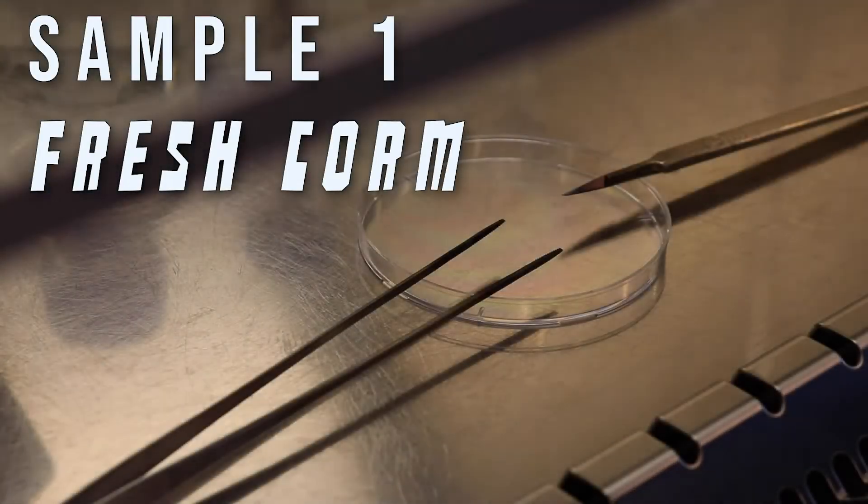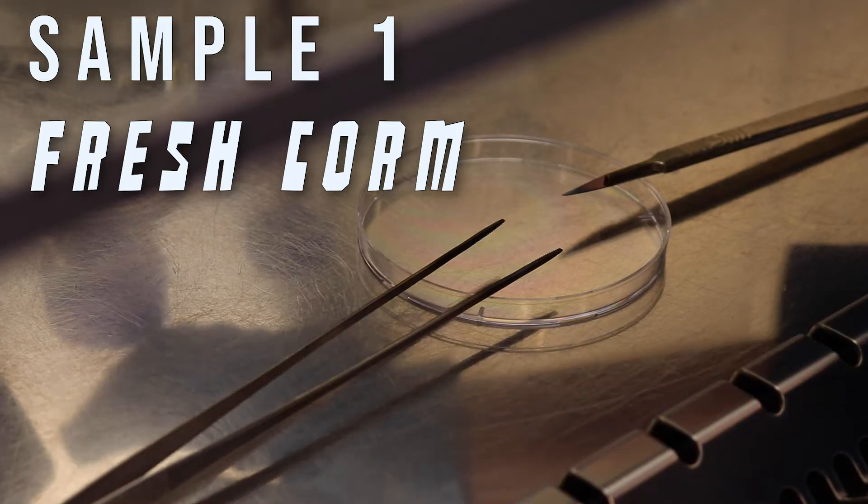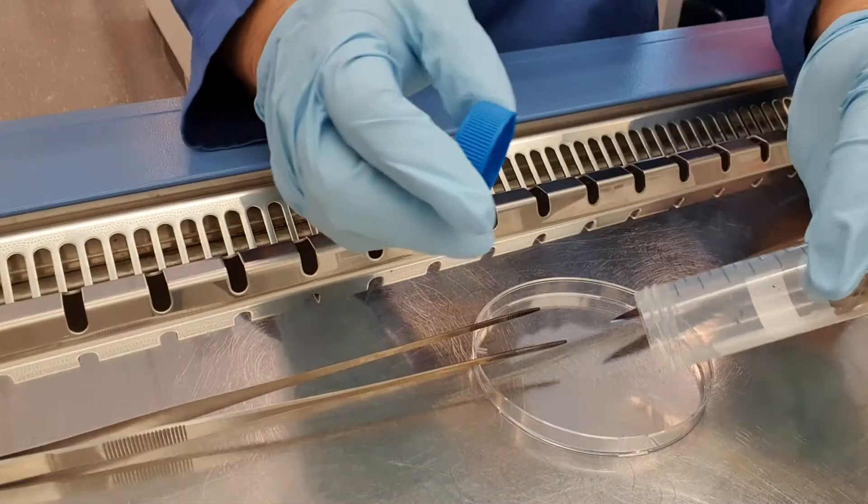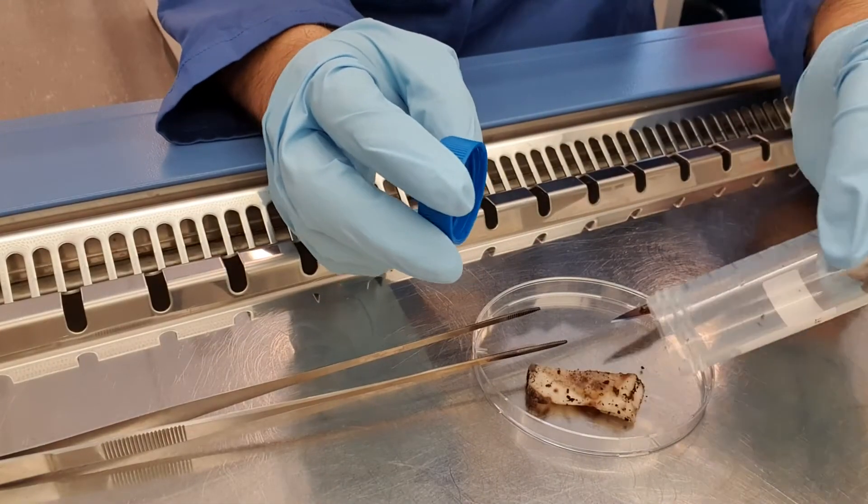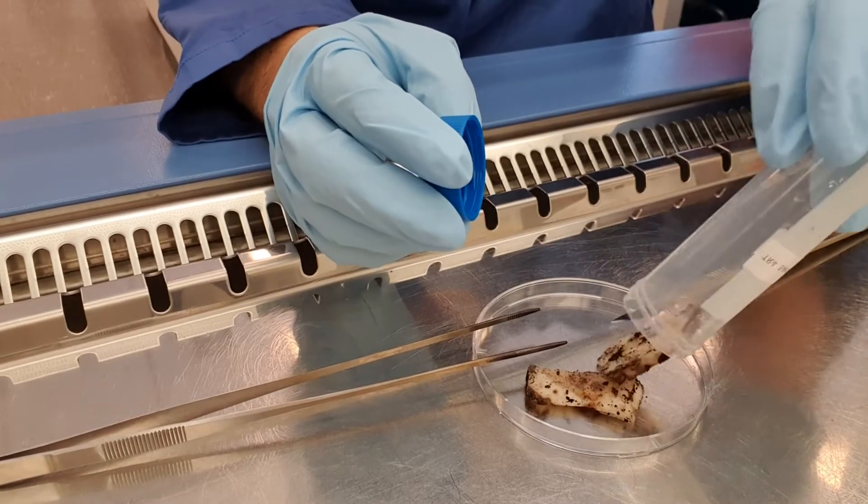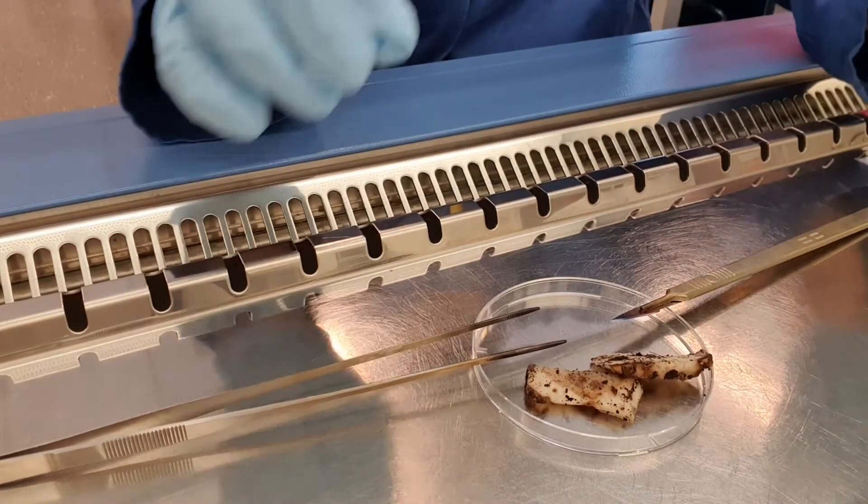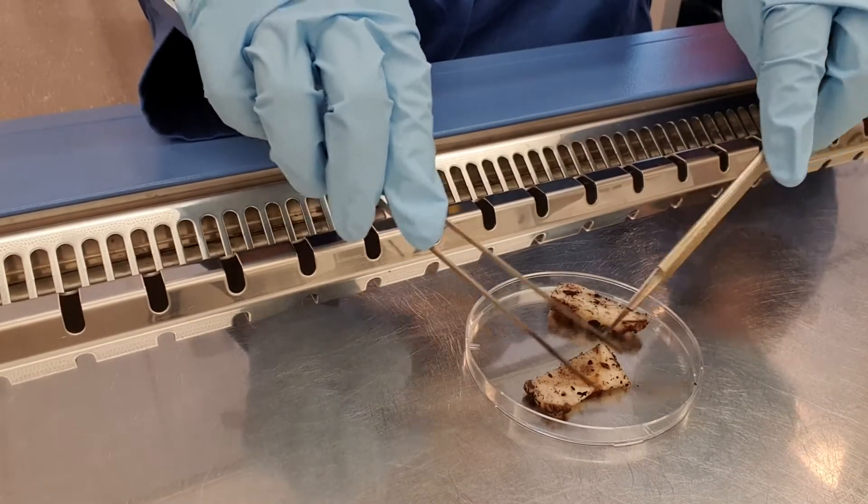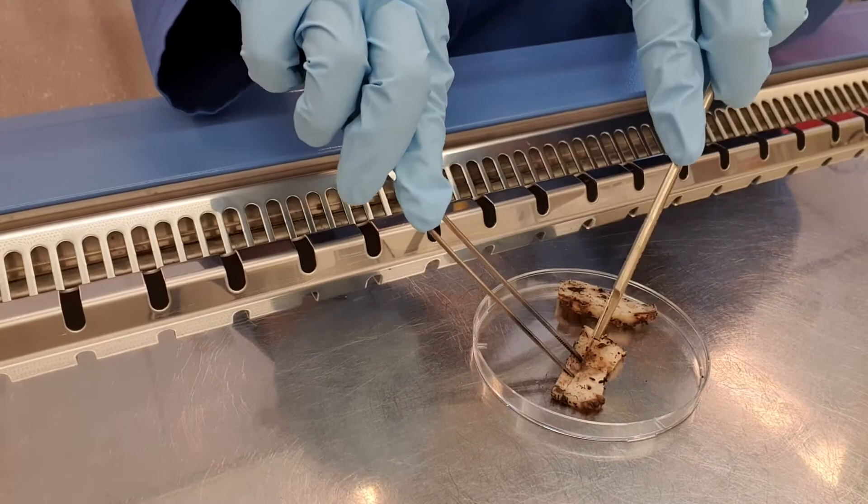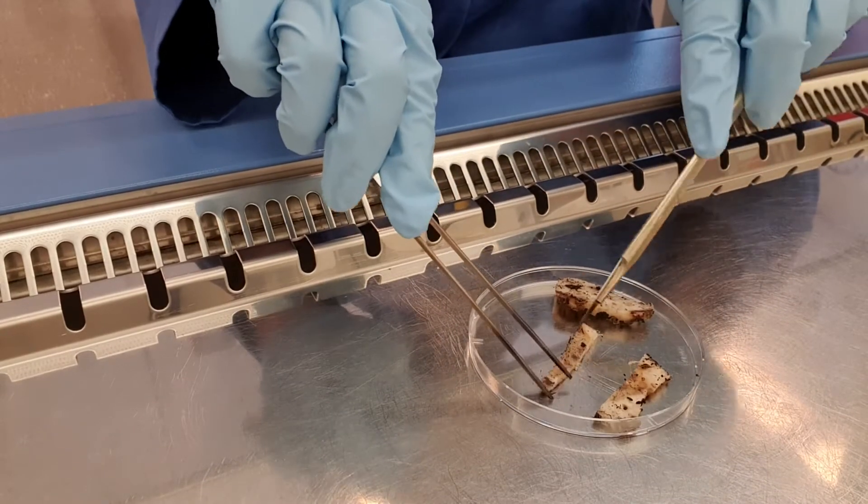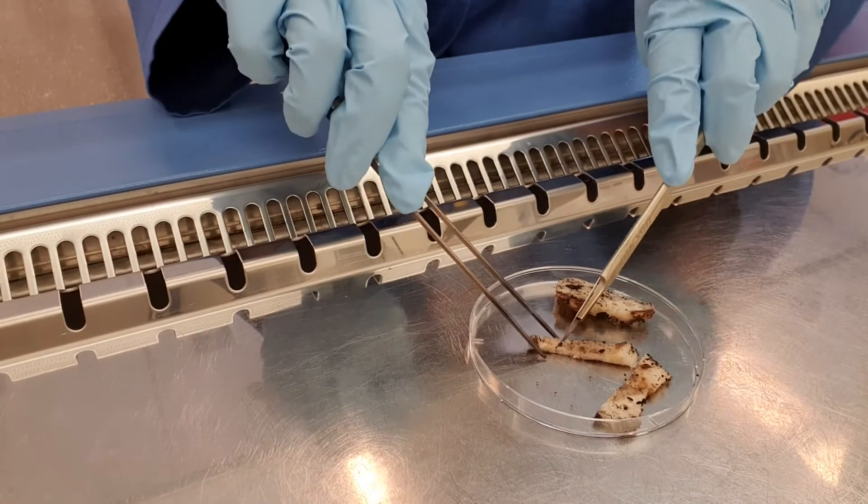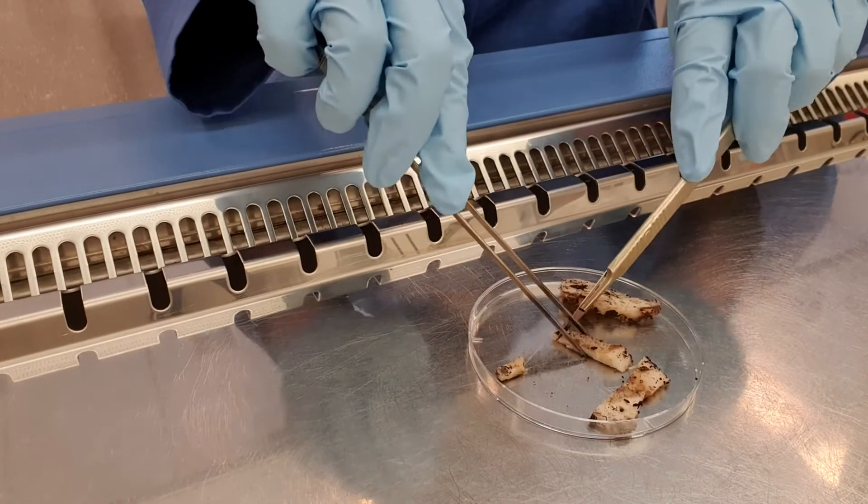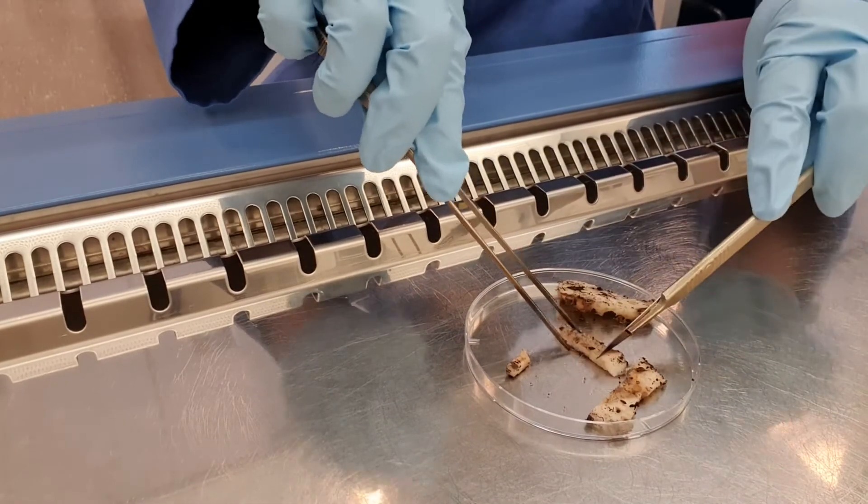We are going to start with sample number one, fresh corm. By the way, we need an additional petri dish in which we are going to cut the material. So we place our samples and now the only thing we need to do is make small pieces. You have to try to cut along the complete diameter of the sample. In that case, you are going to take a good representation of the sample and then just make small pieces.